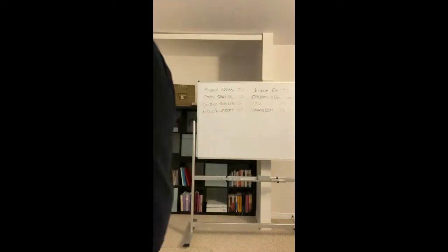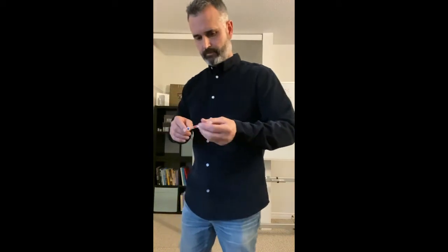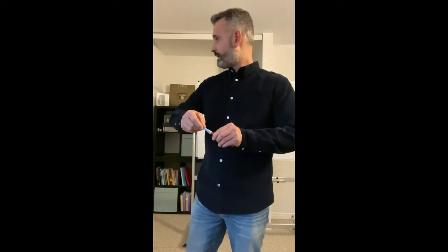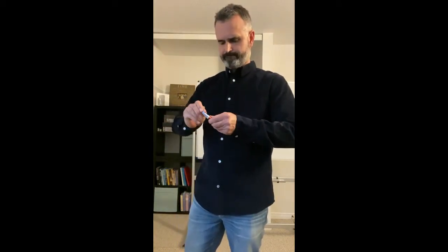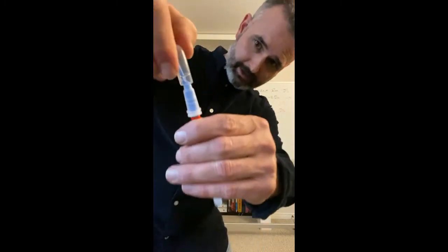And we'll see what we get. All right. So we do our crack both ways. So you want to make sure, basically, you want to get this fluid all the way down to your swab. And I'm all dirty from my boot here. Shake that for 10 or 15 seconds.